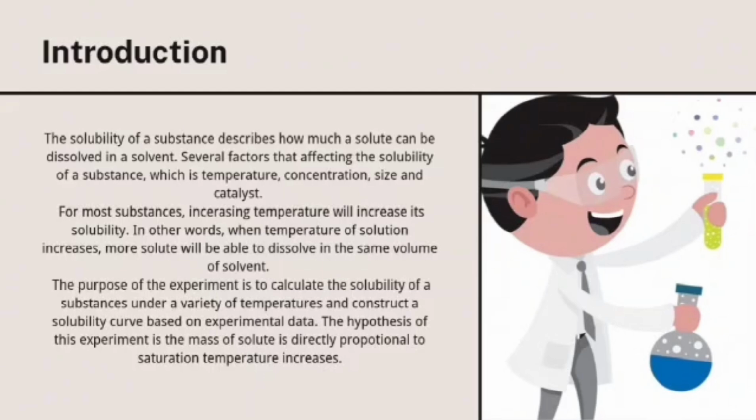solvent. The purpose of this experiment is to calculate the solubility of a substance under a variety of temperatures and construct a solubility curve based on experimental data. The hypothesis of this experiment is that the mass of solute is directly proportional to the saturation temperature increase.